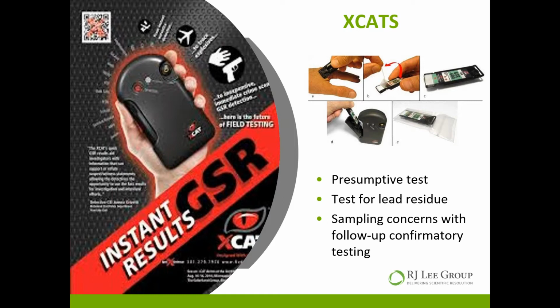This is a presumptive test. Basically, if you look at that little picture up there, it has you pull back an adhesive material, just like the adhesive on the stub. You then dab that material over the hand, or the area of interest. After you do that, you use that little white pad right here and you swipe it over the exact same area. You then put that adhesive material in contact with that white pad and then put this cartridge in this device. You hit a button and you get a reading as to whether or not it's positive or negative.